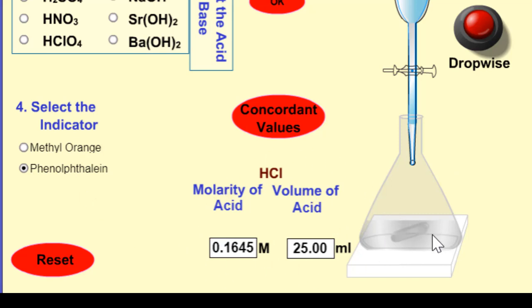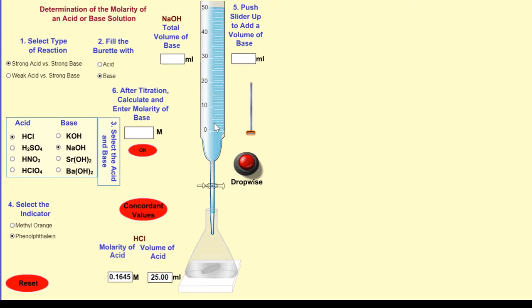Down here I have in my little flask right here. I have a molarity of my acid. Burette is, make sure you write this down, 0.1645 molar. And I'm using 25 milliliters of it. My base is the unknown concentration. The thing in the burette is the unknown concentration. And I'm going to figure out how much volume I'm going to use of this guy.